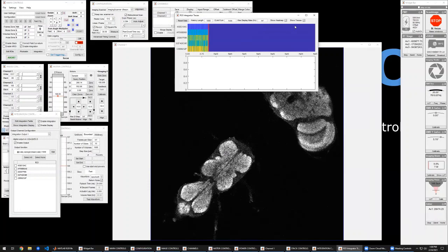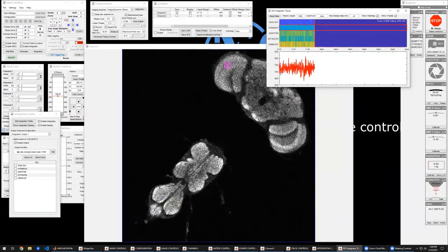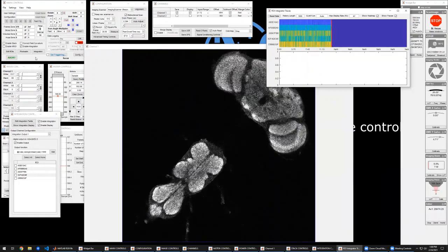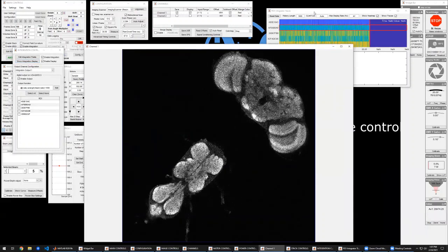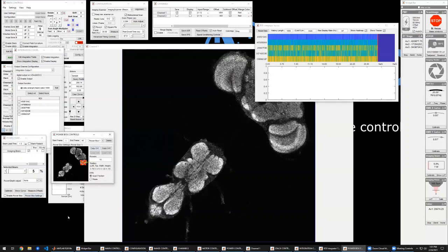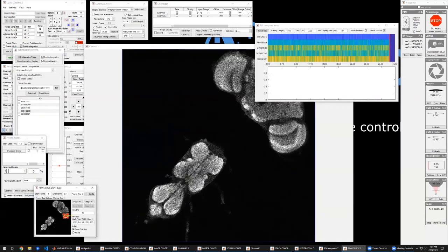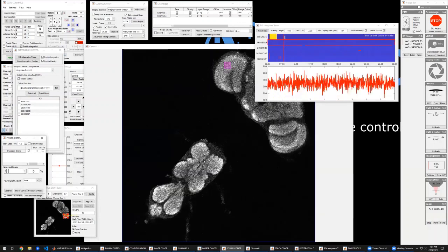And you can see in the image here, as I hover over these different areas in the heat map, it's showing me which ROI is being displayed there. I'm going to do a simple demo to show this display working. I'm going to use the power box feature to turn up power in one of these regions just to show that the display here will see that activity. So using the power box feature, I've just defined a small region here where I'm going to increase the power. So when I turn the power box on, you can see we're now showing some activity in that zone.